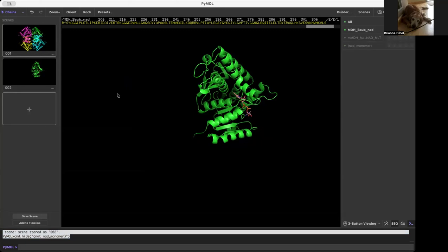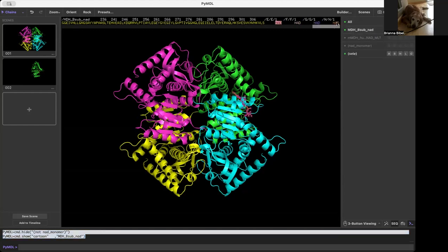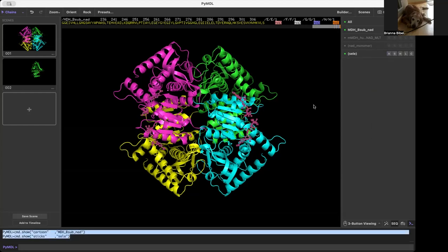If I hadn't had this scene saved, it would be kind of a pain to go back and go show — I want to show as cartoon, but the NAD doesn't show as cartoon, so I've got to show that as sticks. And I want to make sure I only show the NAD as sticks. So I come over here, I select the NAD and show that as sticks. That was a bit of a pain.